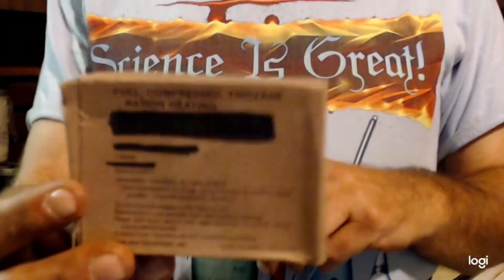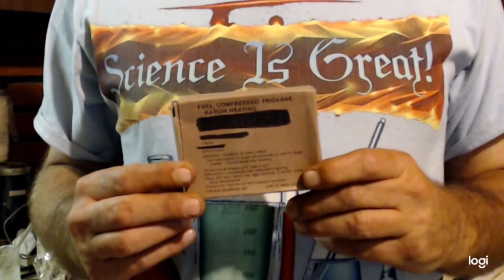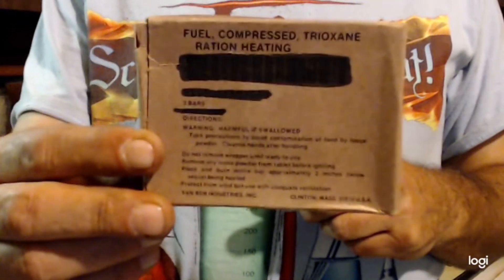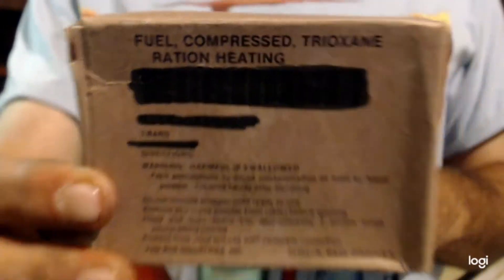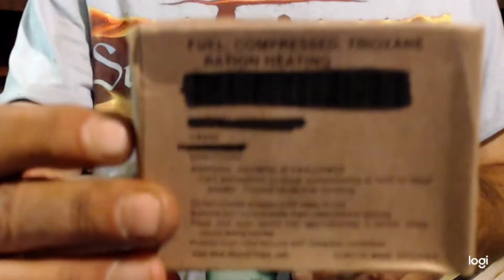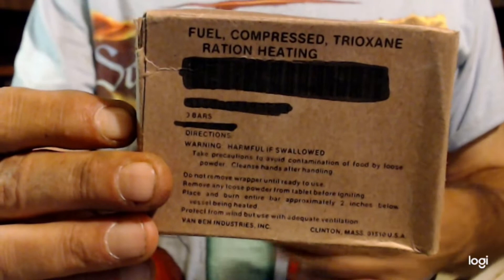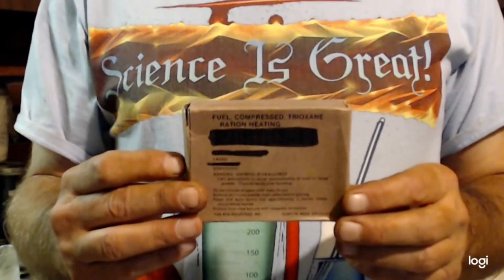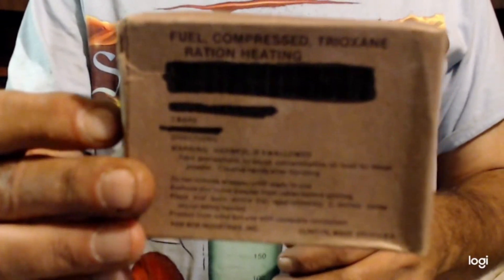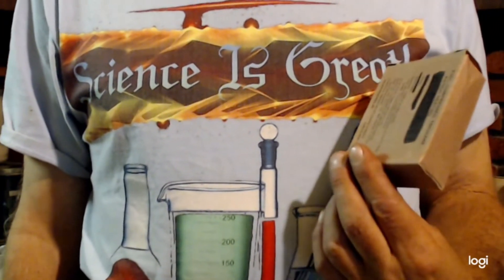If you buy these type of boxes that look like they're from the military, you most likely won't have a problem. But keep in mind, I looked up the MSDS before I bought this, so I knew it was right. Sometimes it'll be like 50% hexamine and 50% trioxane and they'll label it as trioxane. This is like 90% trioxane, not hexamine. Some of them are only 50%, some of them are even lower. So you've got to look up the MSDS first if you decide to buy any of this stuff.